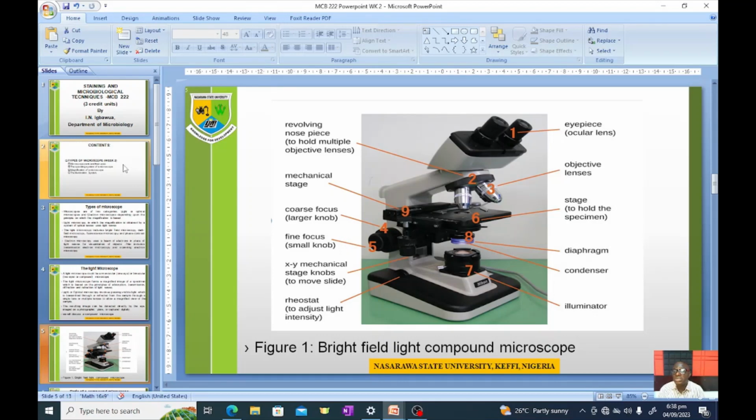Each of the parts has their purpose, and collectively, when used correctly, they give the product of an enlarged, brighter image, which is viewed as a magnified image, the purpose for the instrument.